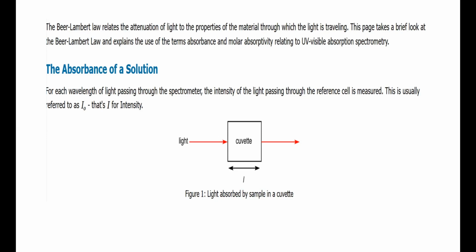The dilute bacterial suspension, then a little heavier suspension, even heavier suspension, like that. If you go on increasing, absorbance values go on increasing, and up to a limit it will increase. After that it will plateau off. This kind of nature is quite obvious, because the amount of light that is going to get absorbed will be maximum if the concentration is very high. So this is very general terms I am using. We have to go very specific now from here onwards.